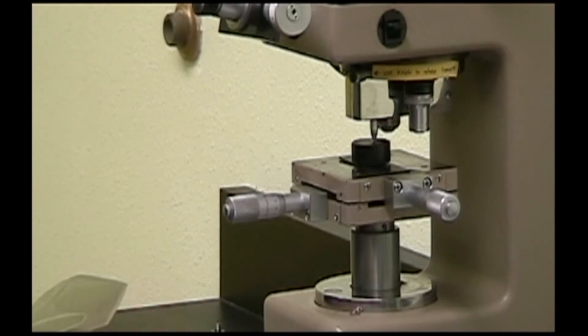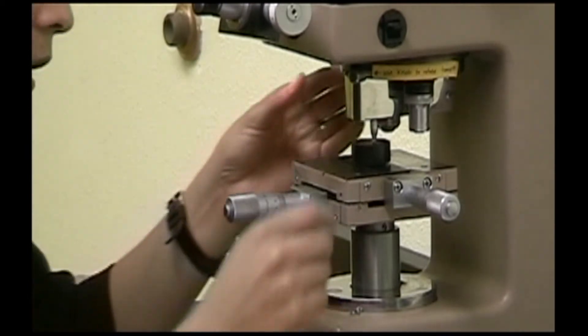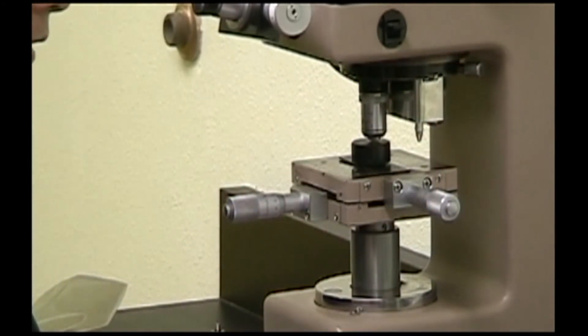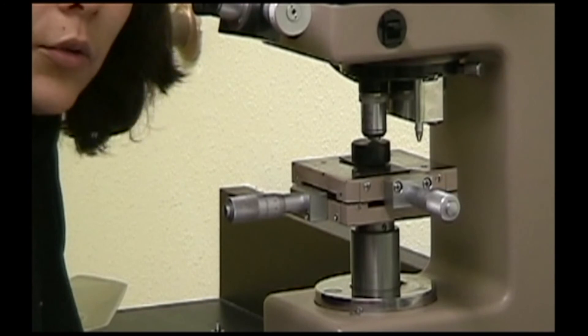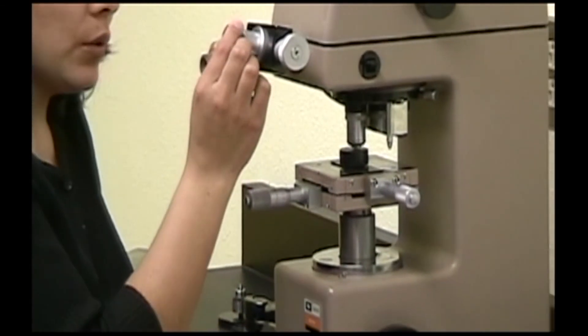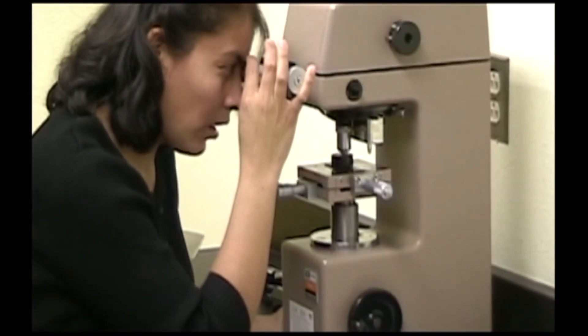When the testing is done, the indenter will go back up and you should carefully switch back to the 40x objective lens to measure the indentation. While looking through the eyepiece, refocus so that the corners of the indentation are very clear. Also adjust the eyepiece so that the crosshairs inside are very distinct.